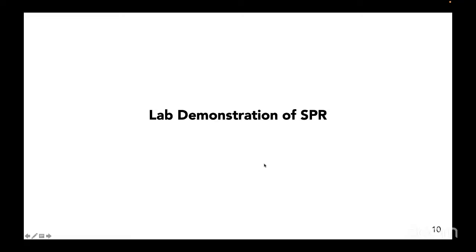So I now request Rucha Gadre at IIT Bombay, who is leading the SPR facility, and she is going to give a demonstration along with Argya to talk to you about Biacore technology, which is one of the key technologies for SPR-based protein interaction. So over to you, Rucha. I am making you full screen now.